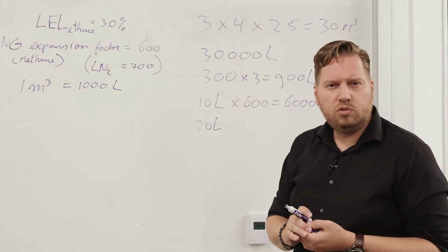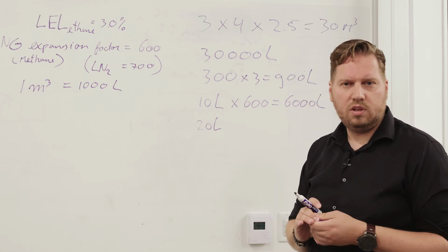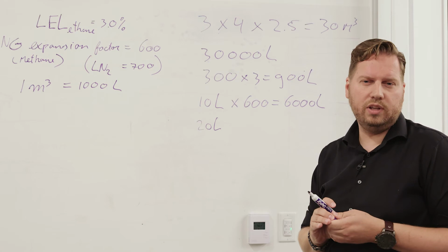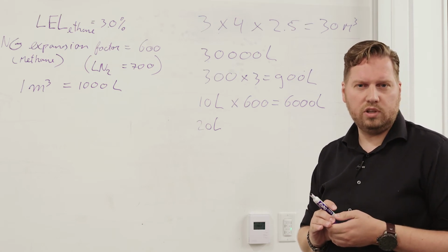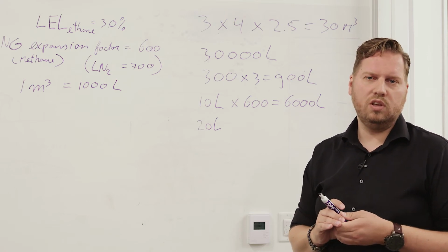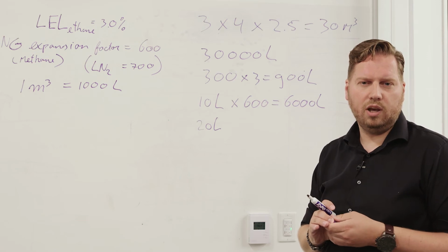So if you want to use bottles that contain liquid ethane, you should install a safety cabinet in your lab, because safety cabinets are ventilated continuously, and also they're locked with very heavy doors. So if there would be an explosion, the explosion would be contained inside the safety cabinet, and also a possible leakage from the bottle is continuously ventilated out.